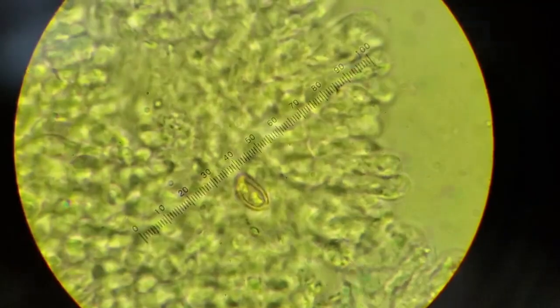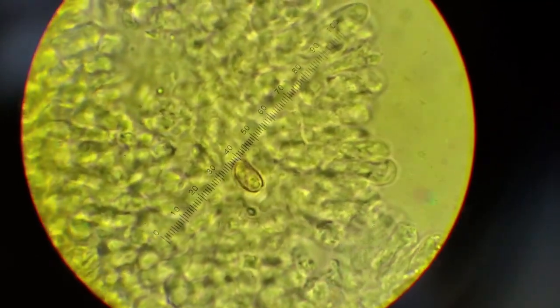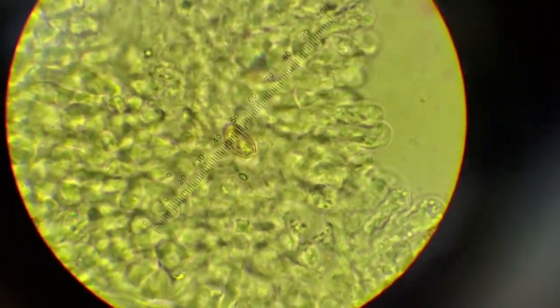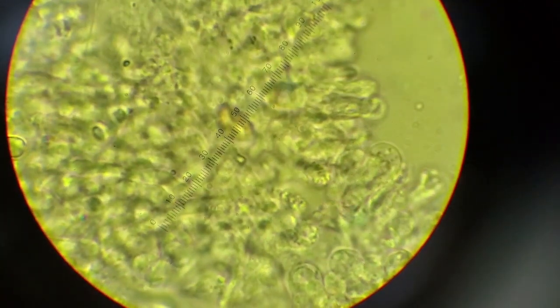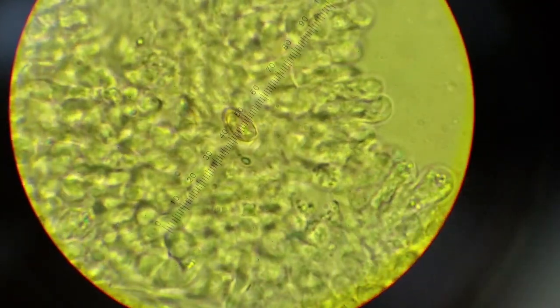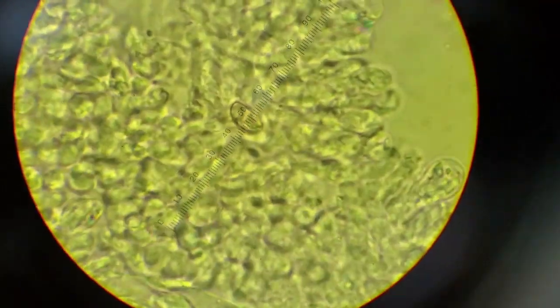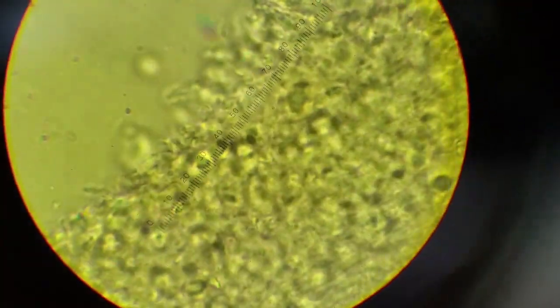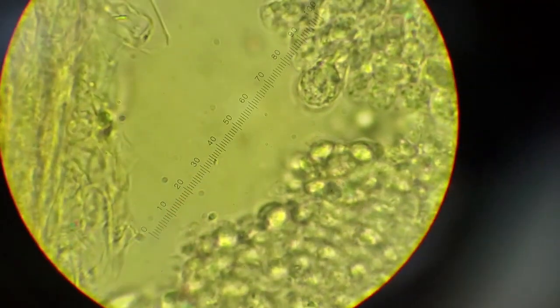You could try. And obviously in this case it's a little hard because I'm using the eyepiece that has the micrometer, which is the same one that's recording. So obviously you would place it in a way where you can measure the width. This isn't quite aligned perfectly, but the problem with this spore is that the apex and the base are not in frame at the same time. They're not clear at the exact same time. So let's try to find another one somewhere, maybe even just in the water floating around. Doesn't have to be attached. Ideally it shouldn't be attached.